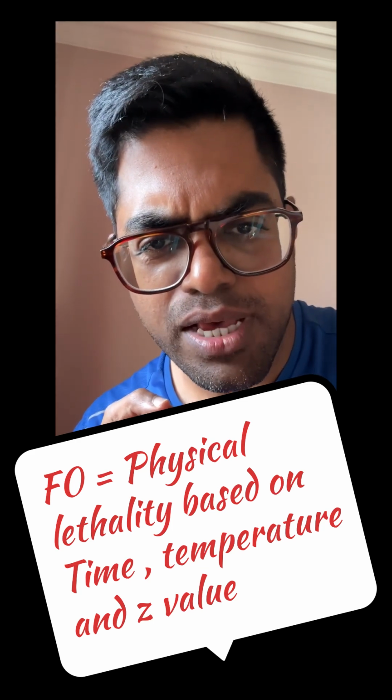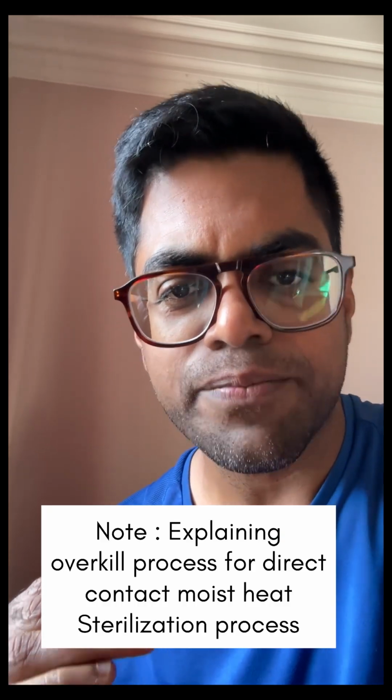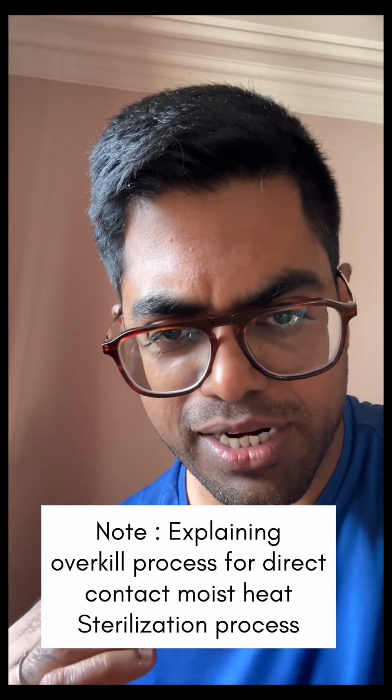In sterility assurance, we talk about once in a million opportunity, meaning 10 to the power minus 6, or something better than 10 to the power minus 6 level of sterility assurance, when you do the sterilizations. If you predict your bioburden level is like a million, 10 to the power 6, and you want to bring it down to a sterility assurance level of 10 to the power minus 6, that is a 6 to 6 journey, total 12 log reduction you need.